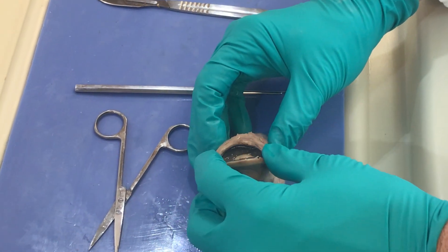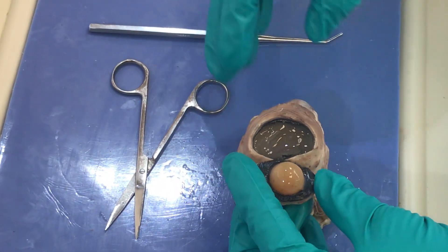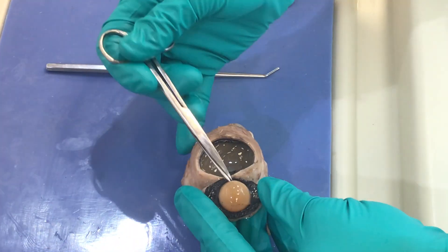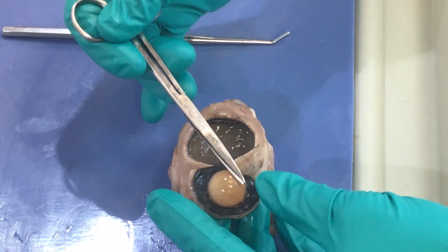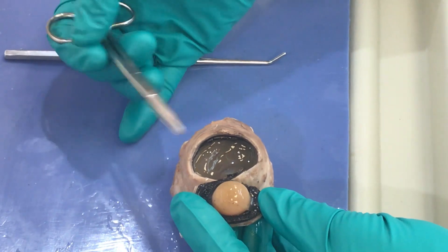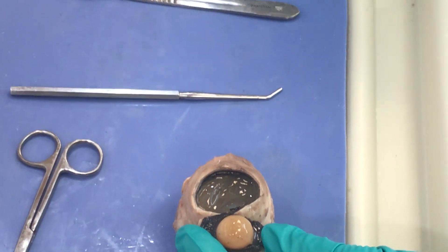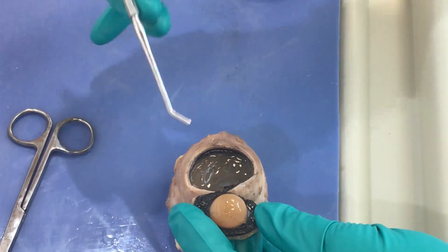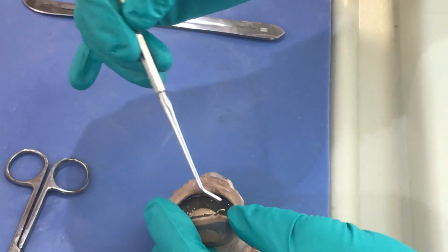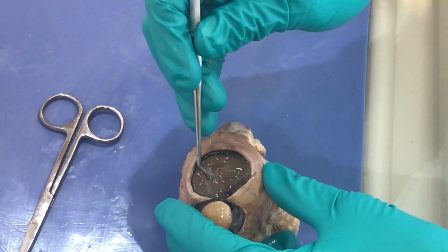Now I'm going to move the cornea and retract it to the outside. I maybe should have made my incision a little bit wider. Here we see this firm structure — this is actually the lens. It's quite hard and should be clear, but because this eyeball is not alive, we're not seeing that. Additionally, you're going to see this jelly-like substance posterior to the lens. Anything behind the lens is our posterior cavity, and this jelly-like substance is called vitreous.